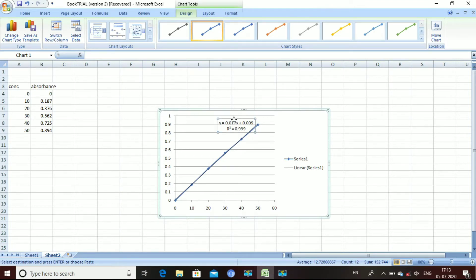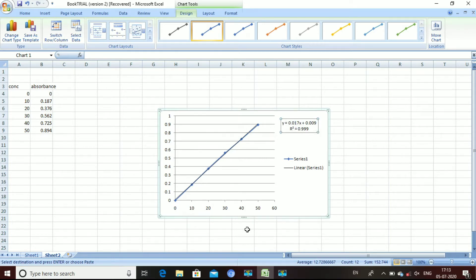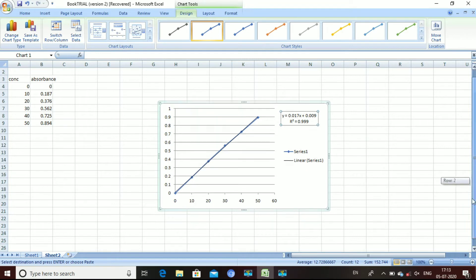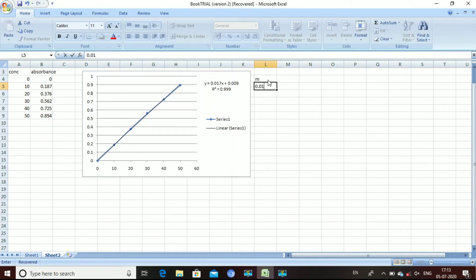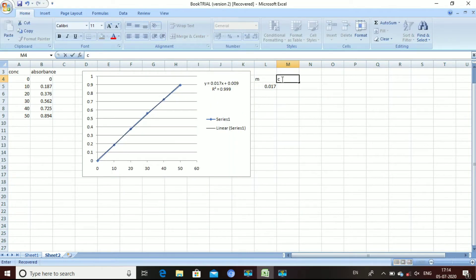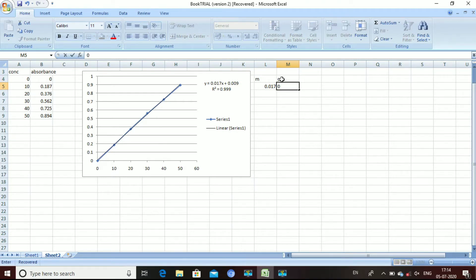You will then get the equation on your graph. It is a y equals mx plus c equation, and using this equation we are going to do the further calculations. In this equation, y is the absorbance, m is the slope which is 0.017, x is the concentration, and c is the intercept which is 0.009.